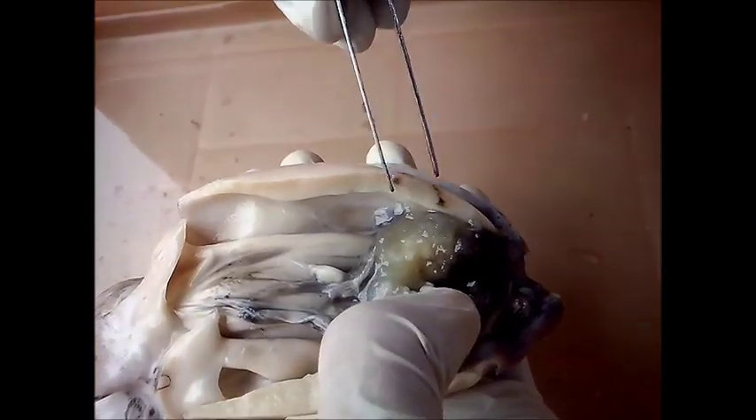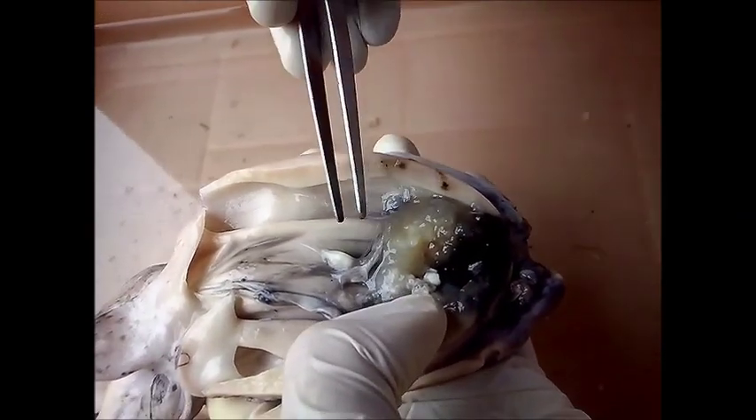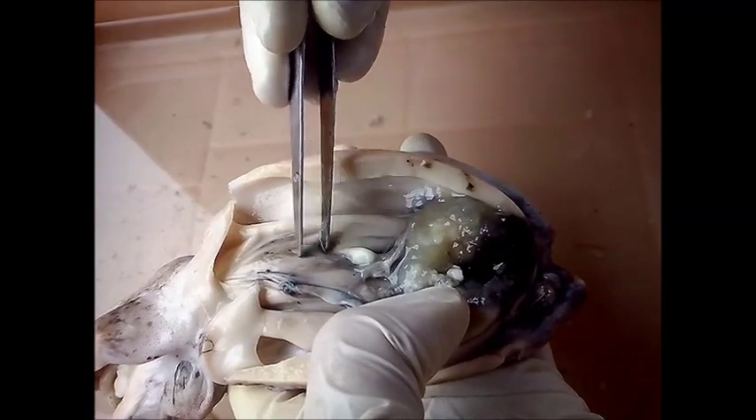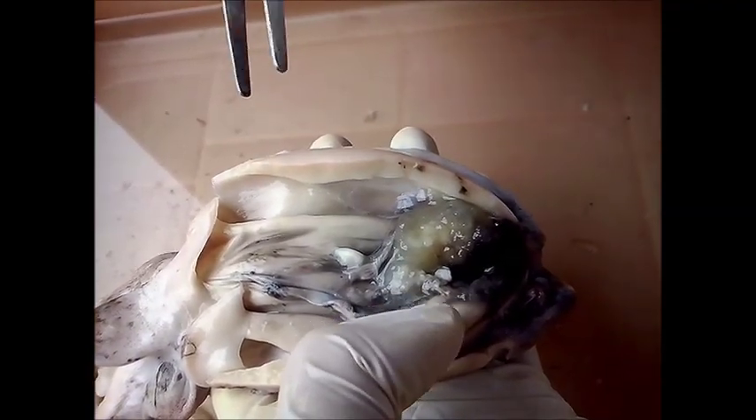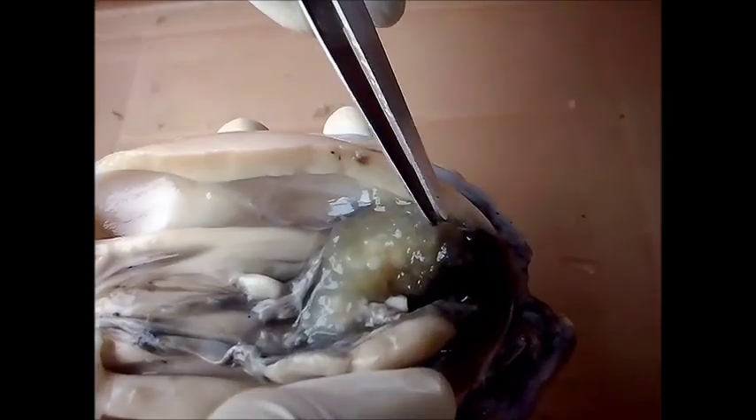In the case of a gravid or mature female, we observe that the ovary takes up a large part of the viscera. In the case of this female, which is a mature female, we see the eggs present inside the ovary.